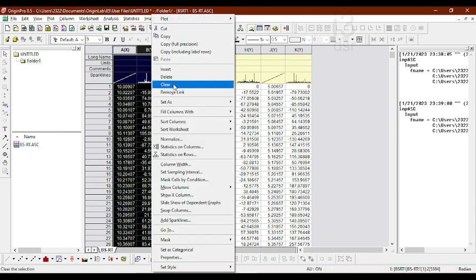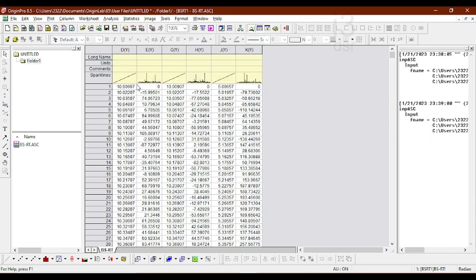So I'm deleting this also. So these are the three different files. This is how it will look when you give it in a new column. If you give it in a new sheet or replace existing sheet, all the data will come in different sheets, which will be difficult for you to plot.